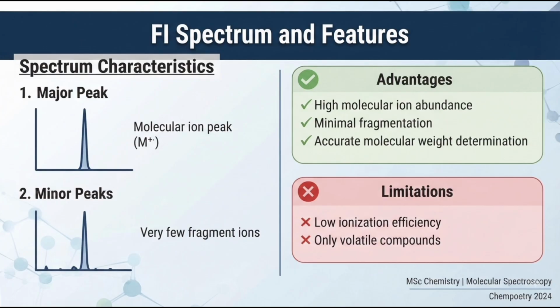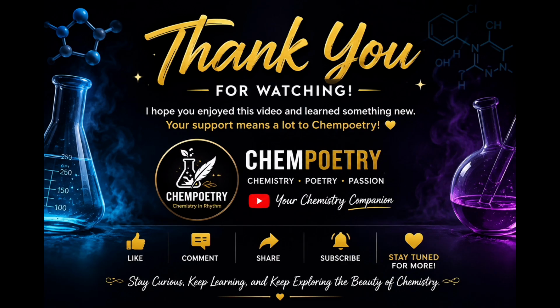In the next lecture, we can continue with other important ionization techniques such as field desorption, FAB, MALDI, and ESI, and understand why modern mass spectrometry increasingly uses soft ionization methods for large and delicate molecules.